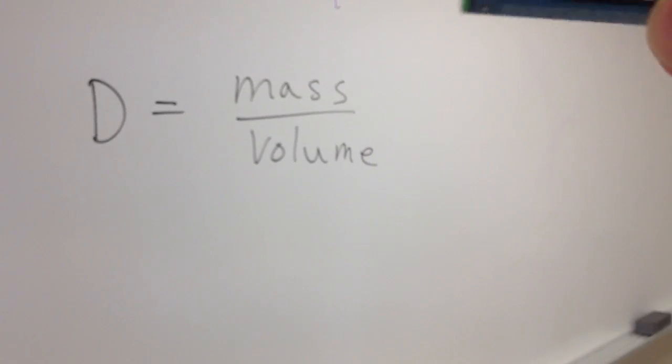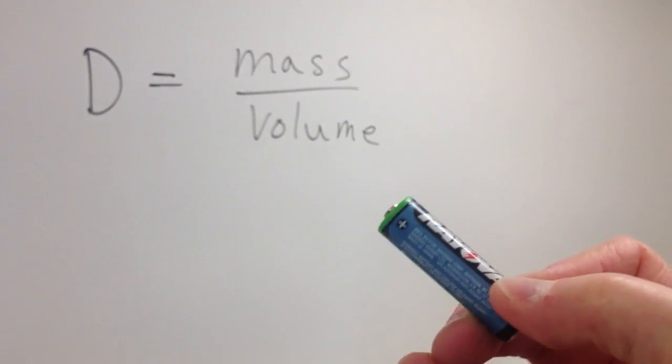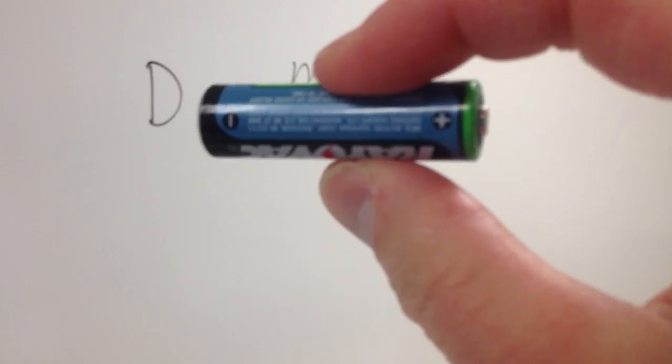What I have here is an irregular shaped object, a battery. First thing I have to do is determine the mass, so I'm going to come over here and use my balance to determine its mass.